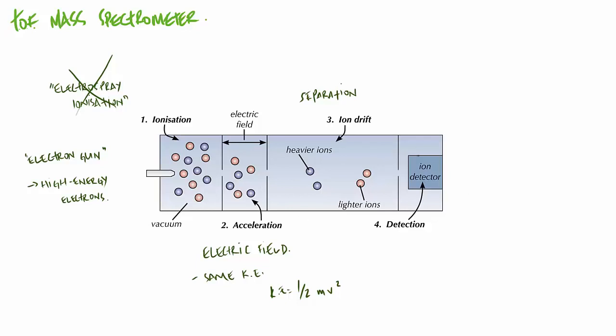And finally is this detection stage. What happens is our ions hit this detector. As you would imagine, the detector detects them, and it detects them by ultimately creating a current. So if we assume that our ion is just M+, when our M+ ion hits the detector, it grabs an electron, being unionized, and in doing so that electron is pulled out.